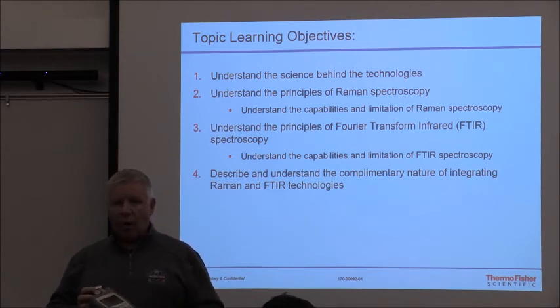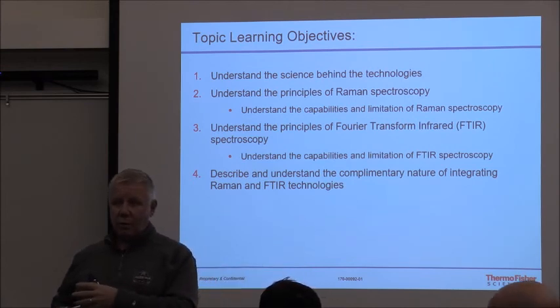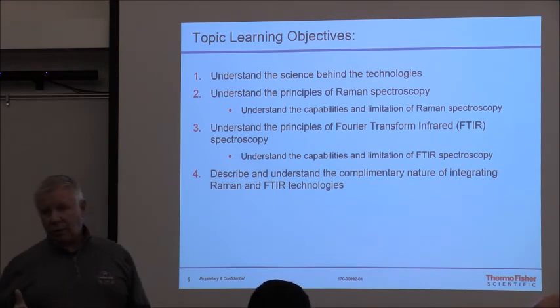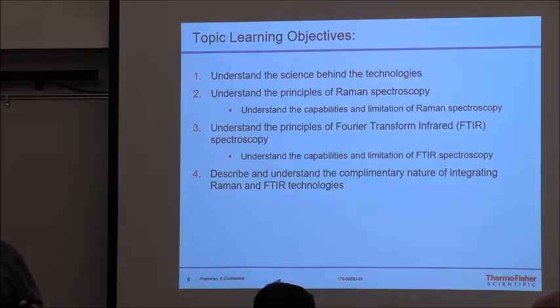It takes all light, white light, and it basically shoots it, think of like a prism or something like that, and it measures the absorption. So that one measures the scattering, this one measures the absorption. And it goes back to my analogy of, you know, the retinal scan versus a fingerprint, okay? They're trying to do the same thing as far as identification, but there's two different ways in which they utilize that, you know, the information and so forth.